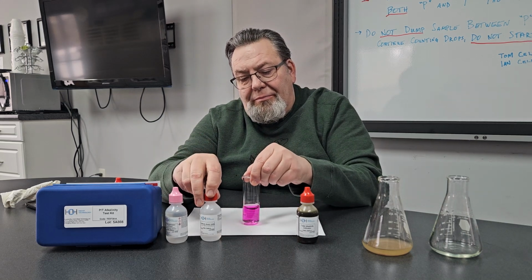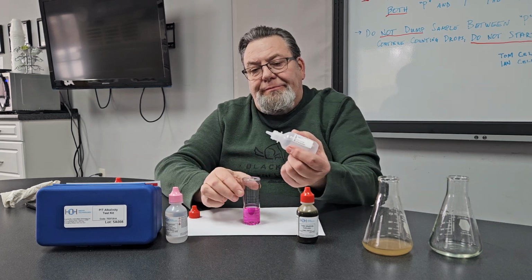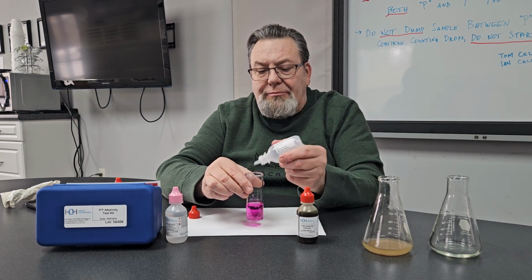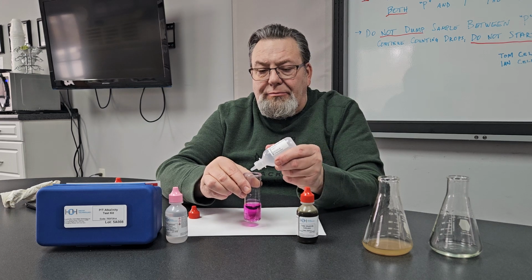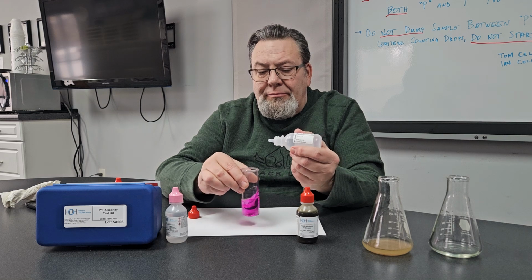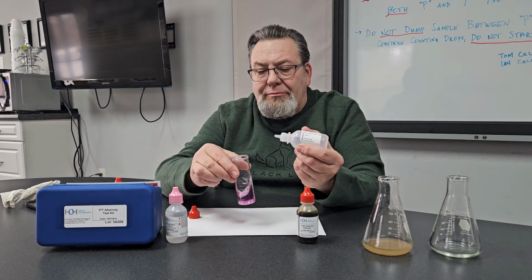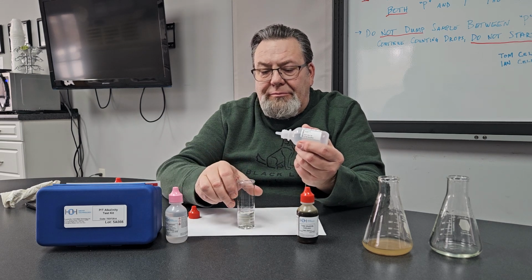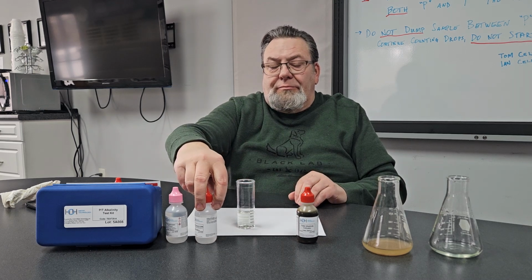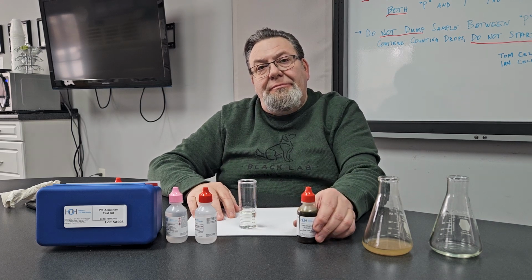Once the sample is pink, we'll add the sulfuric acid, 50 parts per million per drop. We're going to count each drop as it goes in, swirling in between until it goes to clear. In that sample, it was 6 drops to go from pink to clear. 6 drops times 50 parts per million is 300 parts per million as P alkalinity. You'll enter this number into the cloud reports.